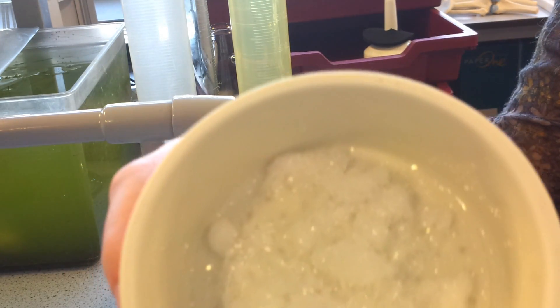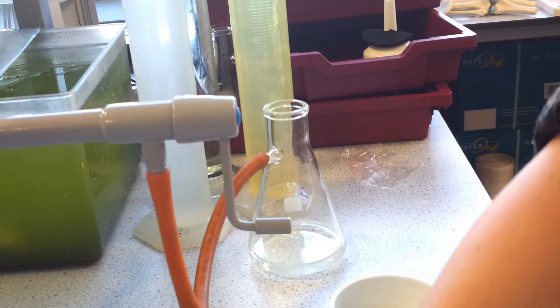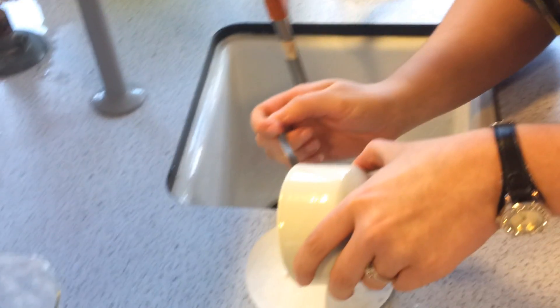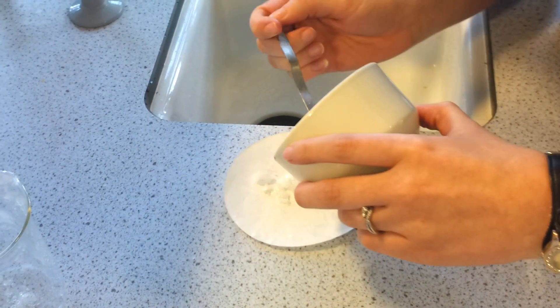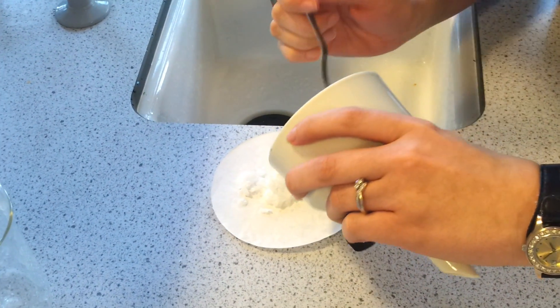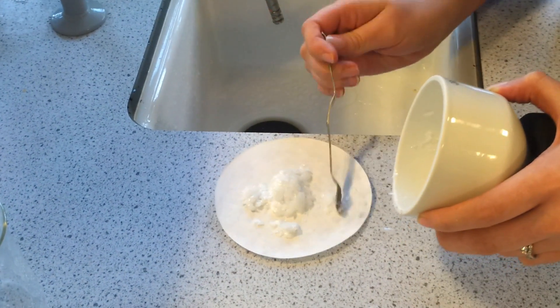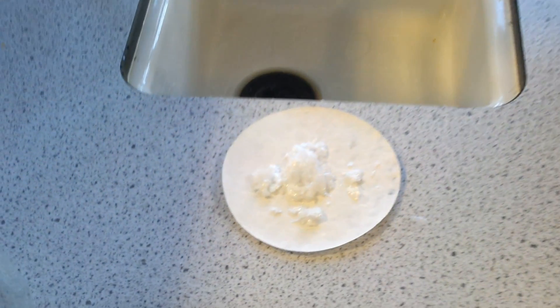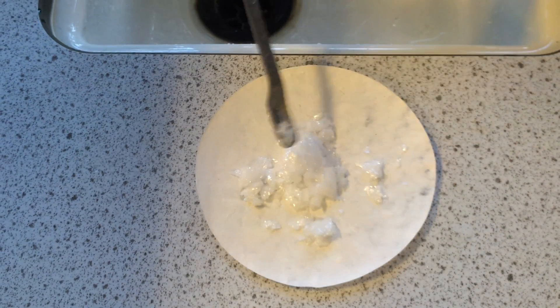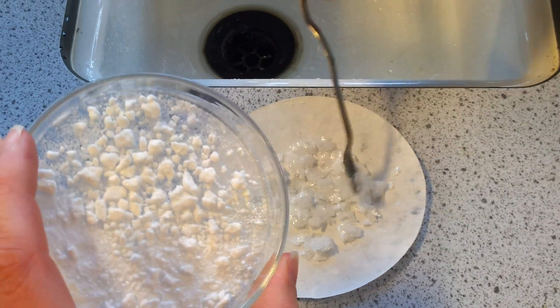Once they're dry, we can then put them onto a piece of filter paper to complete the drying process. You'll want to leave those for a little while to completely dry out, and once they're completely dried they will look like that — dry crystals of aspirin.